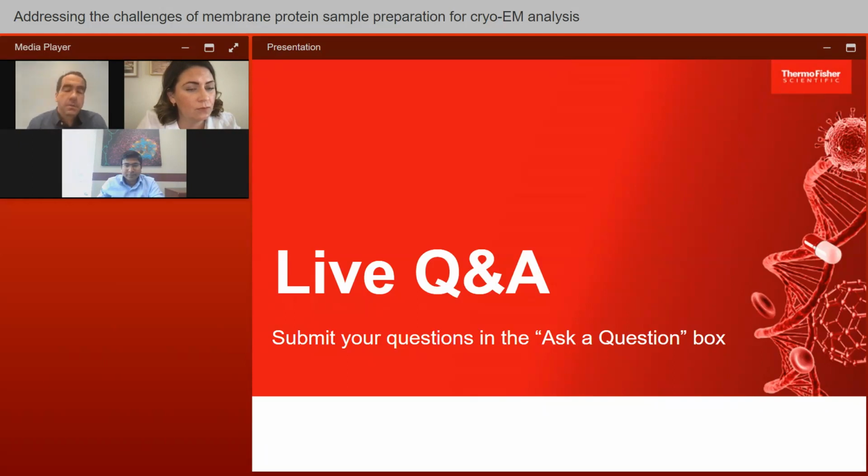So you talked about the Vitrobot buffer screening kit, and there's a question here to summarize. There's a lot of components to it. Does someone need to screen all of those buffers and all of these detergents in that kit to get a result, or is there a limited protocol that can be employed? That's a great question. So yes, there is flexibility. It's recommended to use 12 grids because you can screen 12 grids at once.